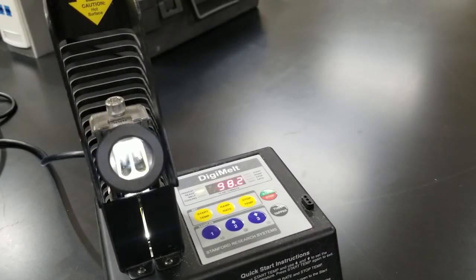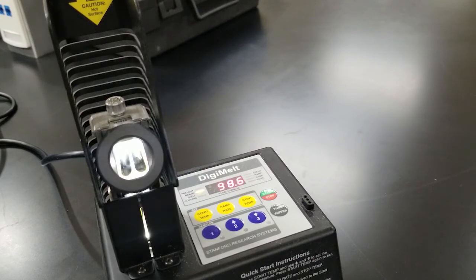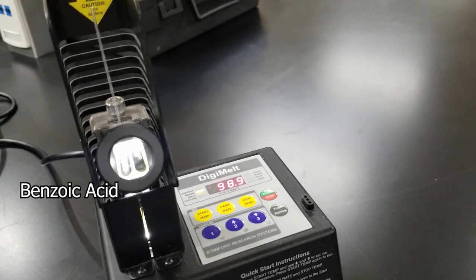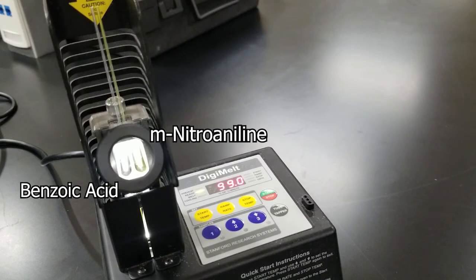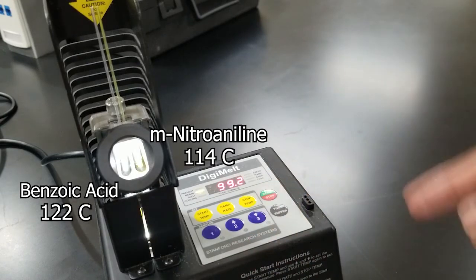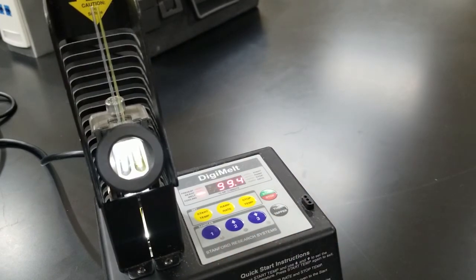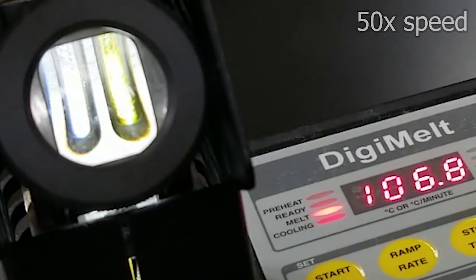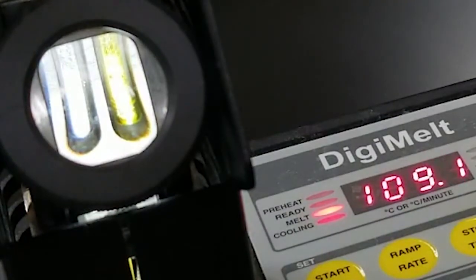For the next samples, we have our purified benzoic acid and our purified M-nitroaniline. On the left is going to be the benzoic acid, and the right side is going to be the M-nitroaniline. I started the starting point a little bit higher this time because I'm expecting them to melt a little bit higher — they have a higher melting point, and the purity is typically better on these two compounds in this procedure. Let's go ahead and get started, and I will fix the focus.